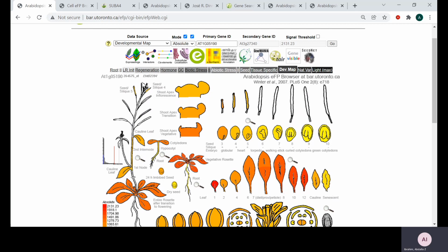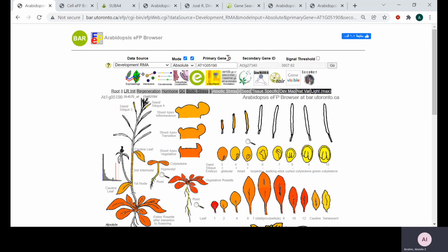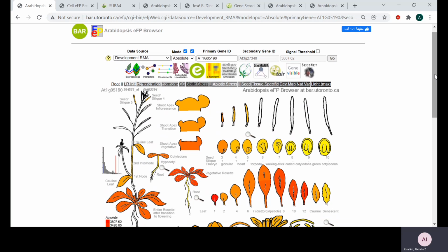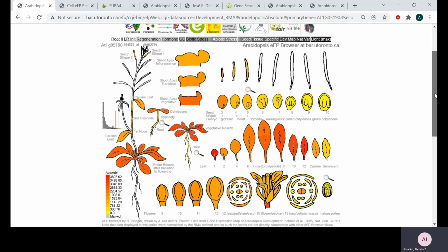This is just an alternative statistical method for analyzing the data that comes out of the gene chip, right? I think it stands for robust multi-chip average. So it's just a different way to look at it. Which one is better, which one is correct, who knows, right?